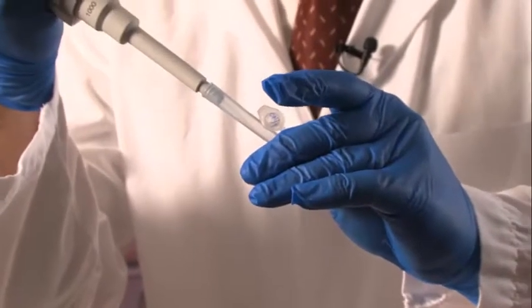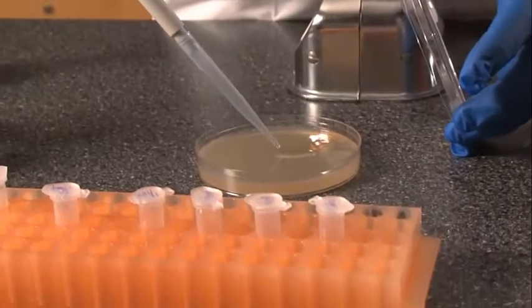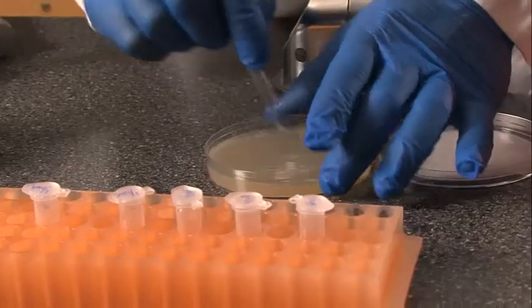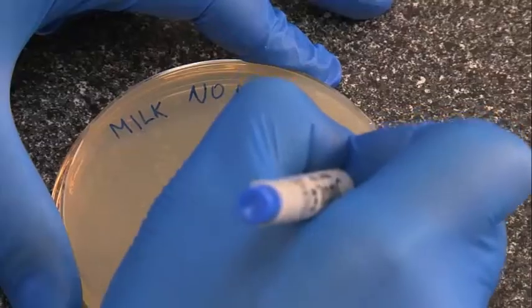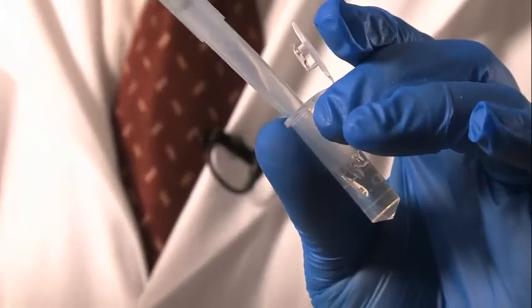In colony-forming units, what a microbiologist will do is dilute this sample serially in a bunch of different conditions and then plate those onto culture plates. We can then count the number of colony-forming units that have formed on the plates in order to figure out how many bacteria were in this initial sample.